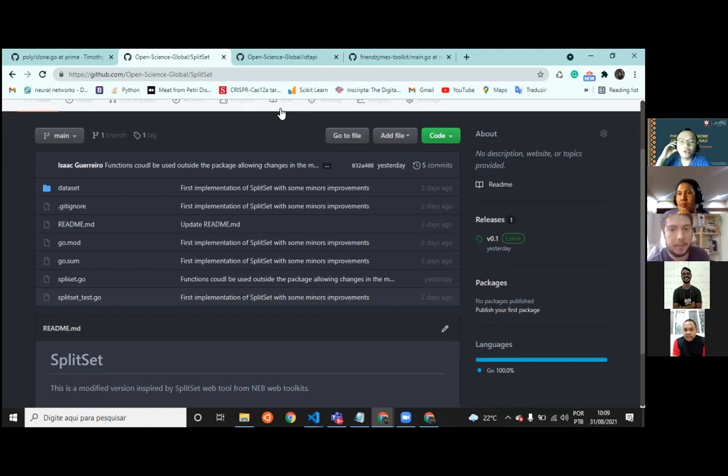Okay. The principle of nanopore sequencing is that it's a third generation sequencing. Unlike second generation, you do not need to really make a library in the sense that you do not need to fragment your libraries, but that still depends on your application. So you can just sequence the DNA in its native conformation.